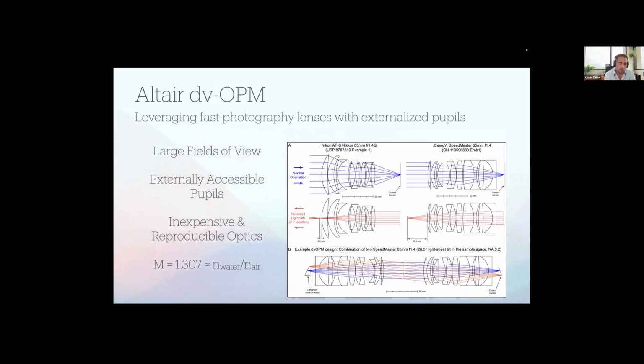So oblique plane microscopy provides a lot of the benefits of a regular inverted microscope. You can bring the objective up, you directly interface with the glass, you can have an autofocusing mechanism if you'd like. You can keep your sample sterile, you can do multi-position imaging. If you have large things, you can scan that thing in each dimension quite far. And so there are a lot of advantages.